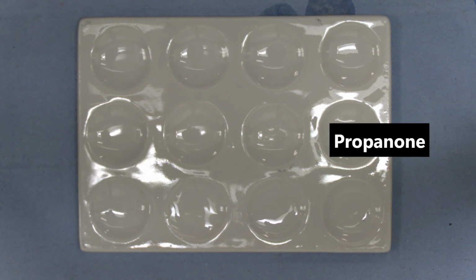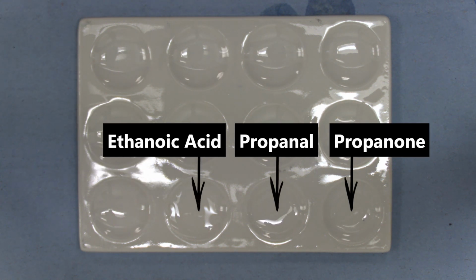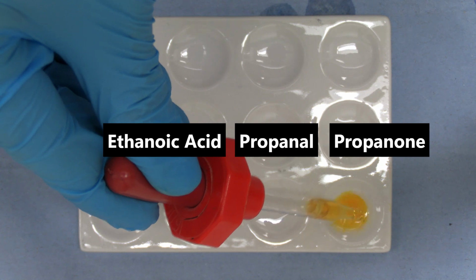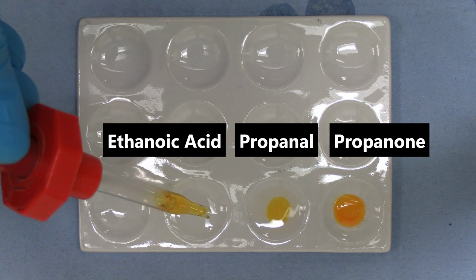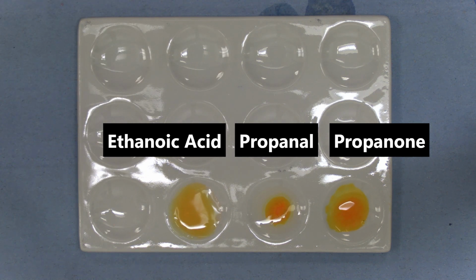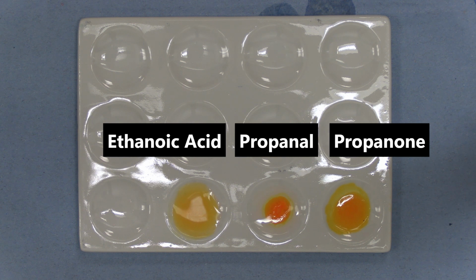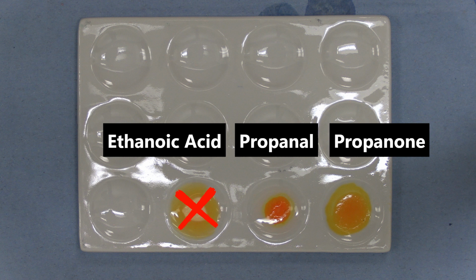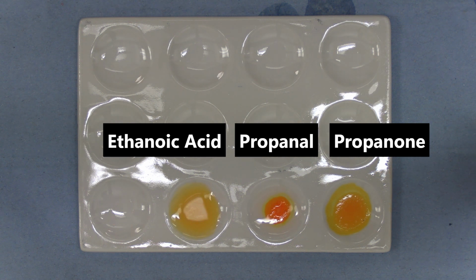Here we are testing propanone, propanal, and ethanoic acid. As you can see, propanone forms a yellow precipitate, while propanal forms an orange precipitate, indicating the presence of the carbonyl group in both. Ethanoic acid, however, fails to produce any precipitate, indicating a lack of the carbonyl group.